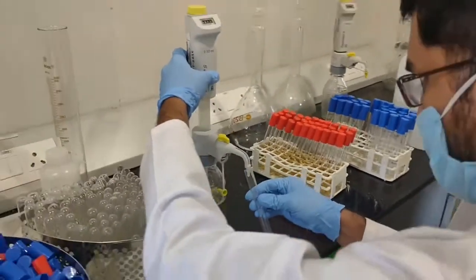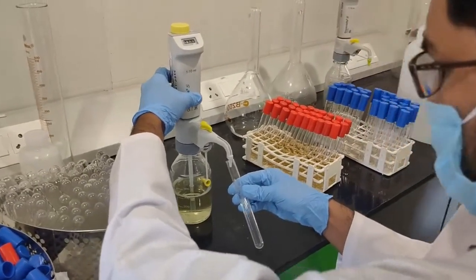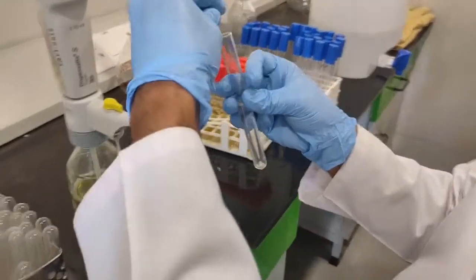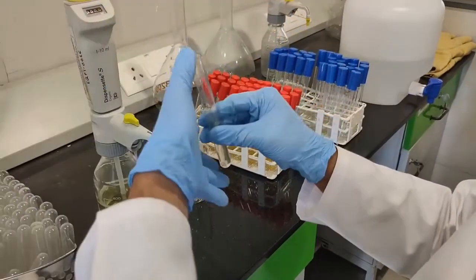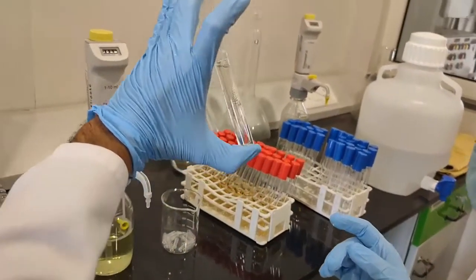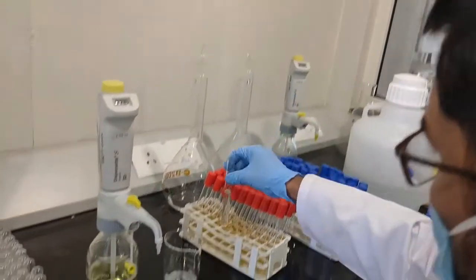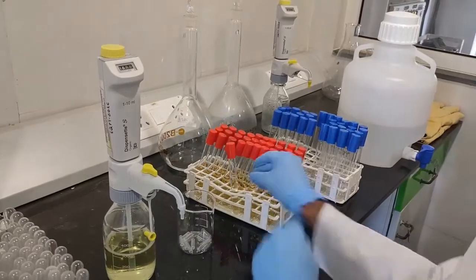After media preparation, dispense 10 ml of media into each tube. Insert a Durham tube in an inverted position into each tube — the Durham tube should be completely filled with medium, leaving no air spaces. Then close the caps and keep aside for autoclaving.